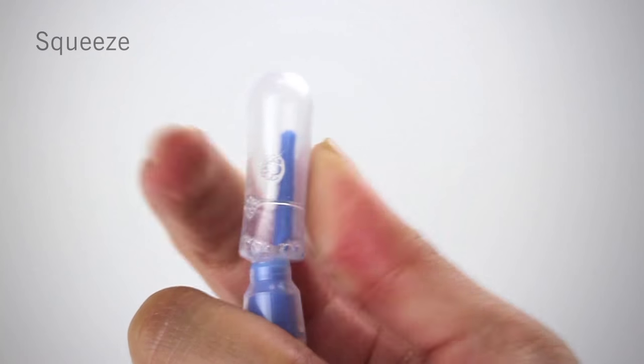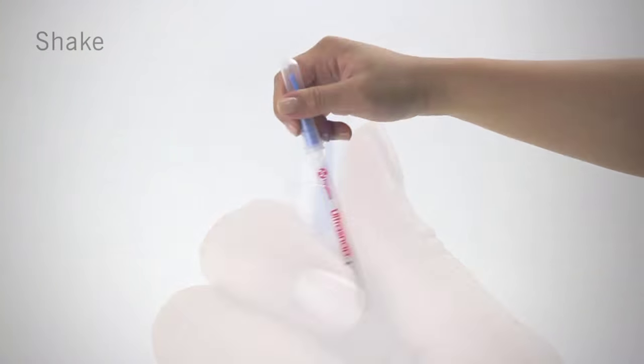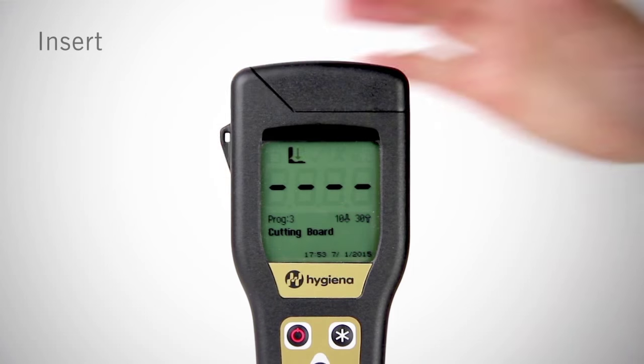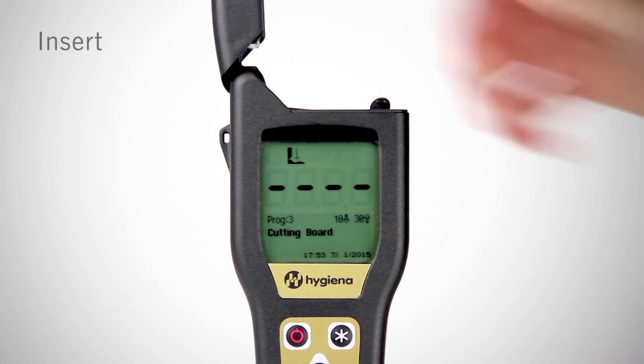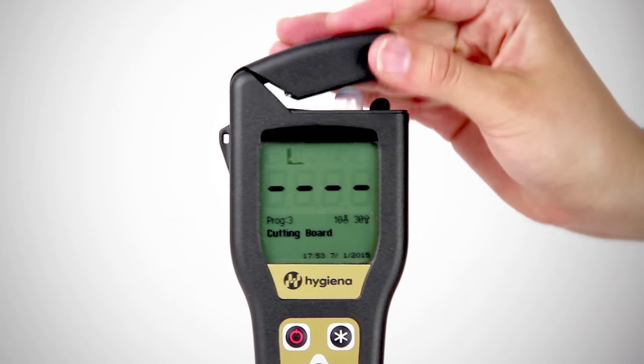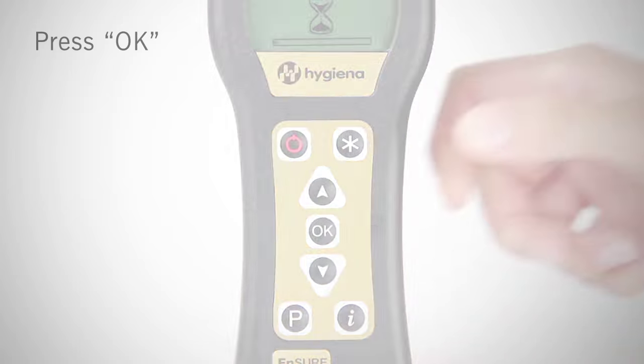Next, squeeze the bulb twice to expel liquid into the tube. Then shake for 5 seconds. Insert the swab into the reed chamber and close the lid. Hold the luminometer upright and press OK to initiate measurement.